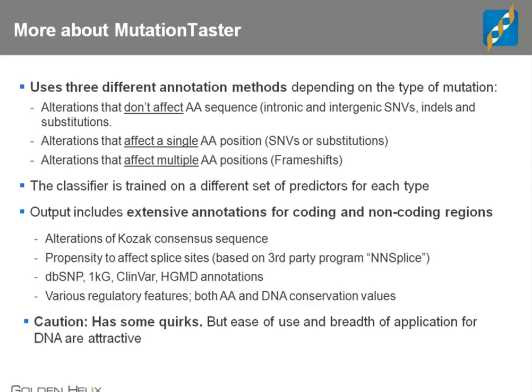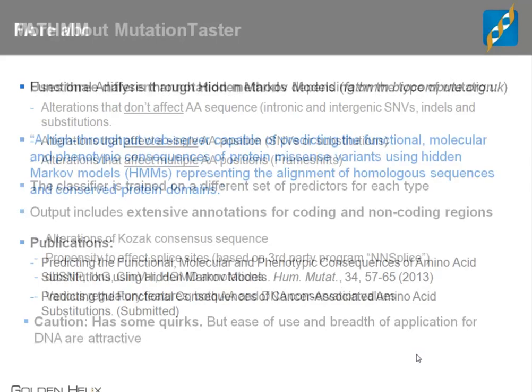And one of the really interesting ones, I noticed that I had a SNP in a gene with 4 different transcripts, but the SNP was actually like 600 bases downstream of the 3' end of a few transcripts, but it was still annotated as being in those transcripts and affecting splicing of them. And so, just some little quirks like that, but once you get used to it and figure out the pattern there, you'll find that Mutation Taster is very helpful.